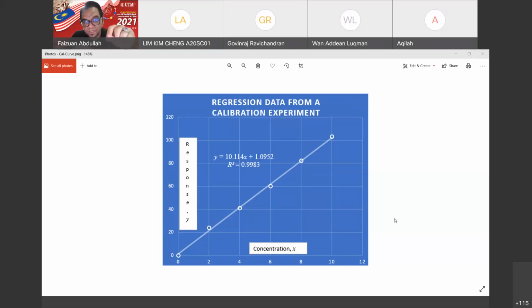After you calculate M1, V1, M2, V2 and put the certain amount, what solution do you put up to the mark? What kind of solution did you put into the volumetric flask up to the calibration mark? Anyone? Yes, distilled water, or deionized water, ultra pure water, meaning only water, right?